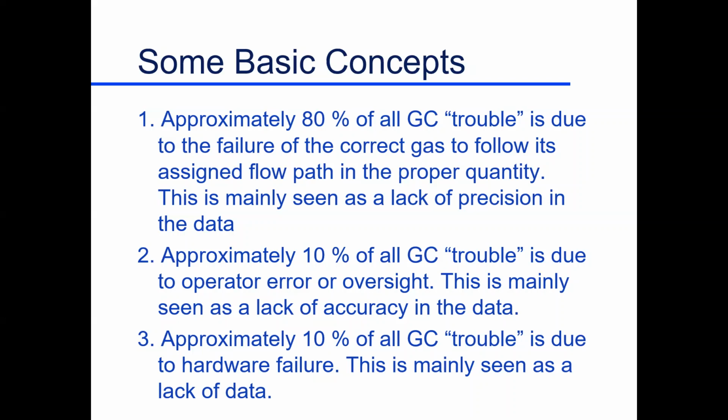If you're working for an analytical company and you do one method all the time, every day, you run 1,000 of these analyses, you're going to pick your column, and it's going to be optimal for that purpose. We tend to compromise in all of them because we do many different things in our lab. Some basic concepts.